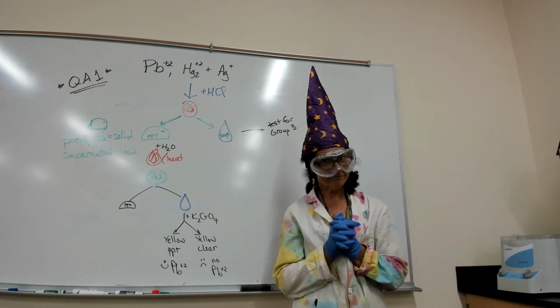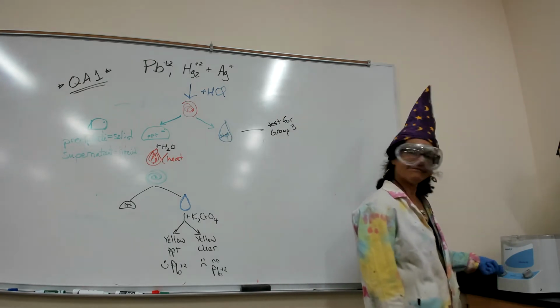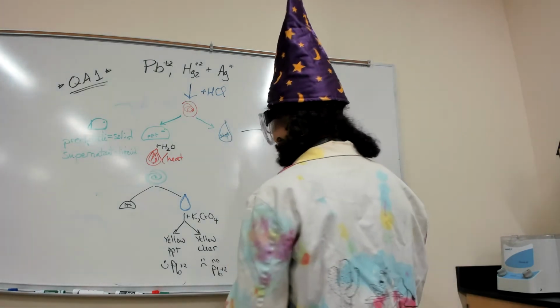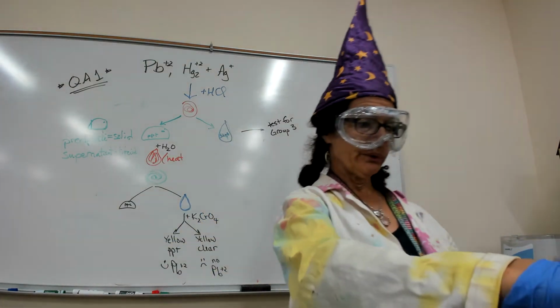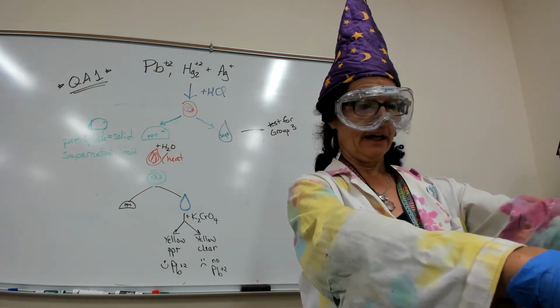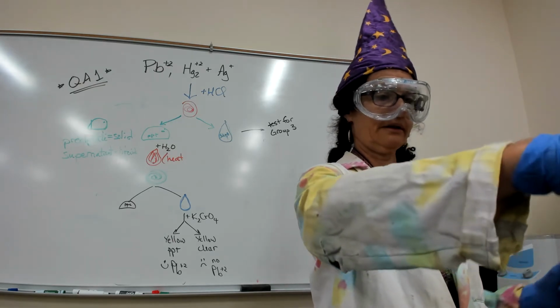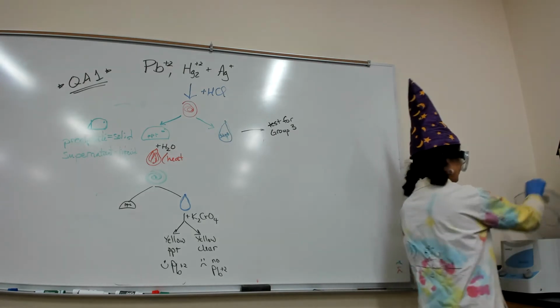ZYX, WVU, TSR. All right, we're good. We wait for that to come. And we're going to separate. So we're going to put this in another tube. I have my 2 test tubes.